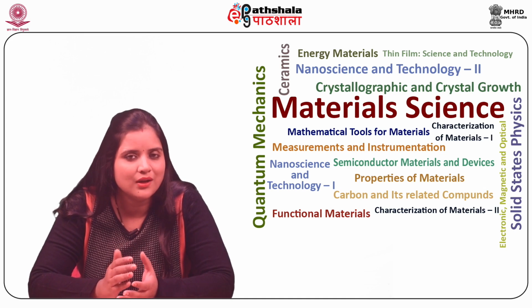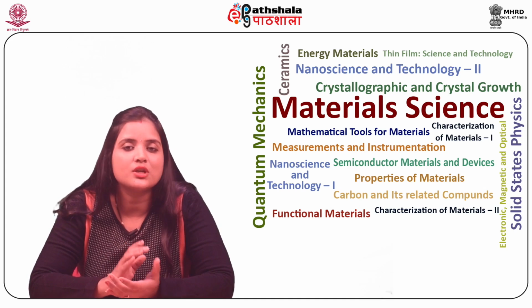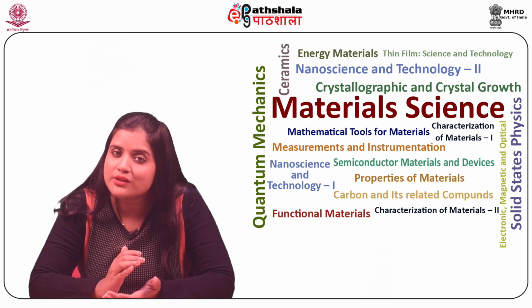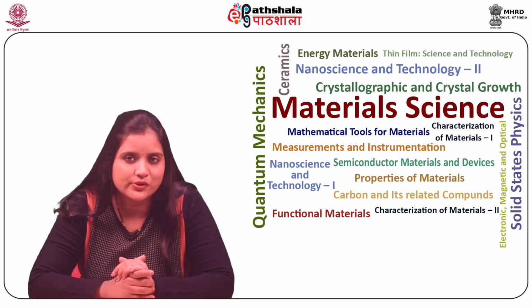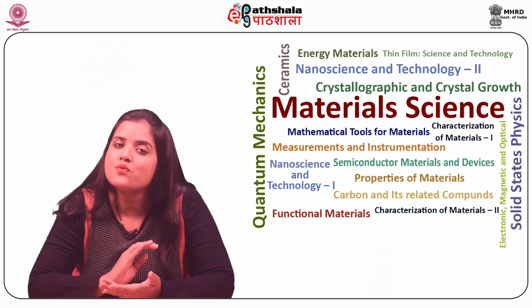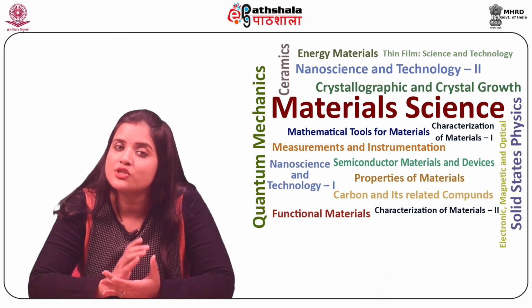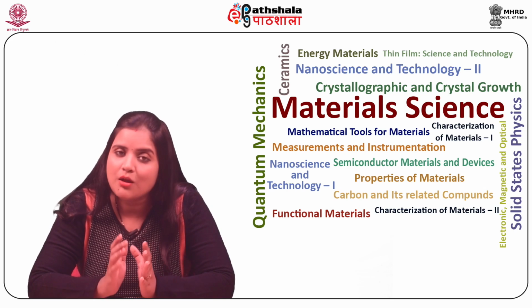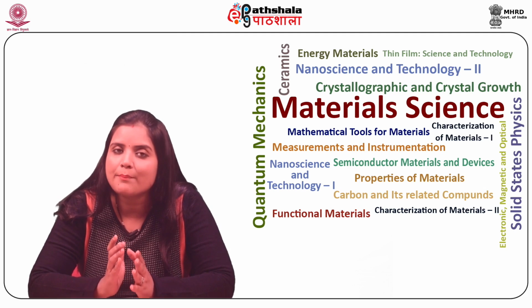A numerical algorithm can be used to reconstruct the object image. Hence, a computer algorithm replaces the lens used in traditional microscopy to construct the image. The information of the object is fed to a digital image sensor, that is, a photodetector, and the image of the object is reconstructed by the computer.